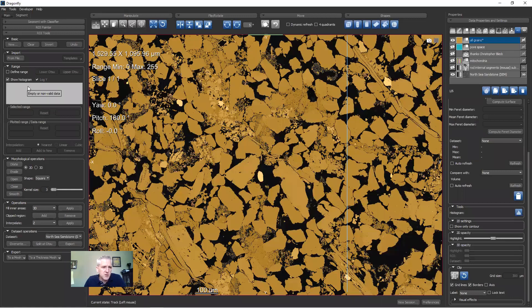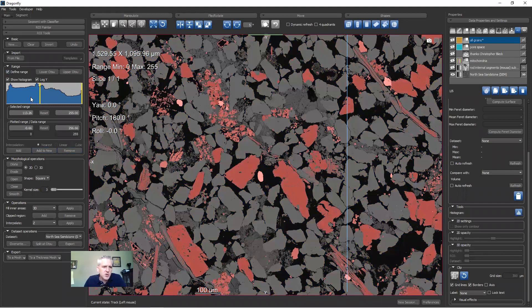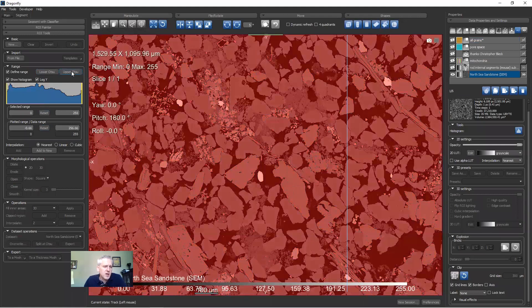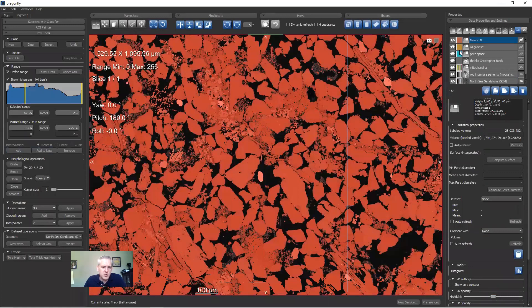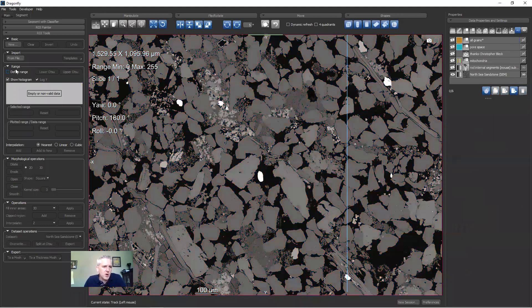So you have a good idea of what Add and Remove do in the Define Range panel. You can also click Add to New — even if you don't have an ROI selected, you can set your threshold, click Add to New, and a new ROI is created with all currently selected pixels. In this case it's identical to the all-grains ROI. I'll select that new one and click Delete since I don't need it. That covers most of what we need for the Range panel.